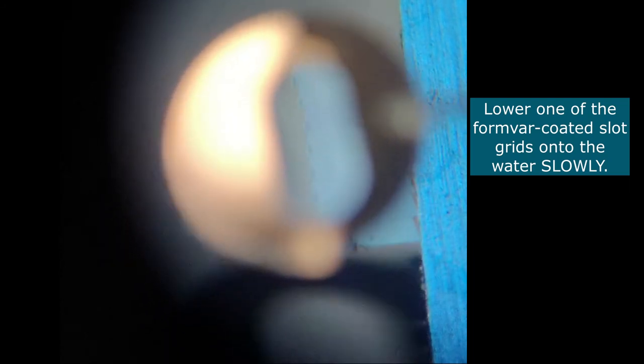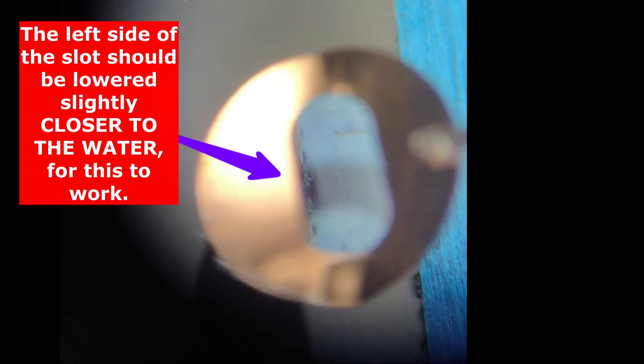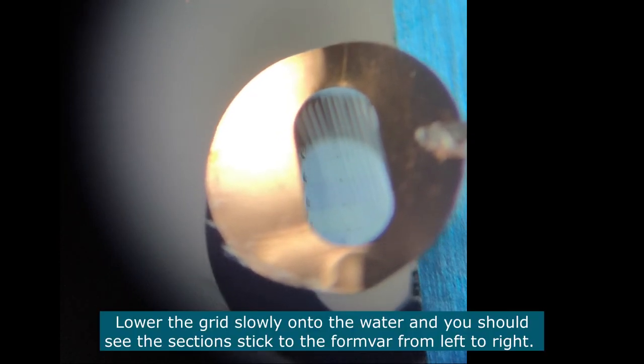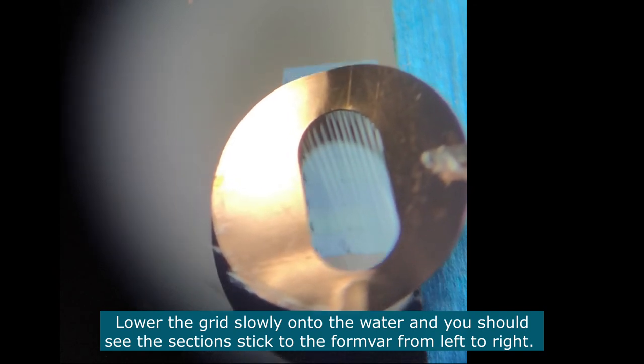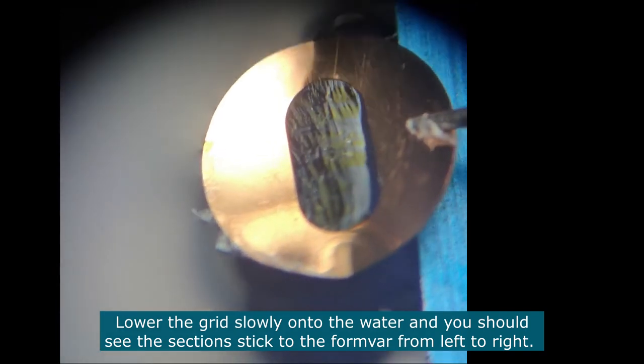Then you lower one of the formvar coated grids so that it aligns with one edge of the serial sections. I'm lowering it quite slowly. So you see what's going to happen, and then there you go.